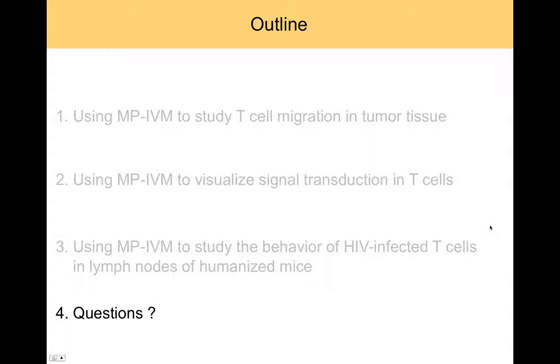To what extent these assumptions replicate the in vivo situation is always unclear. So there's always residual uncertainty as to whether what you find is real or not. And I think that's an important point to consider when evaluating the value of these intravital imaging studies, that it presents an ultimate reality check to the extent that you can generate a model system which really replicates physiology.